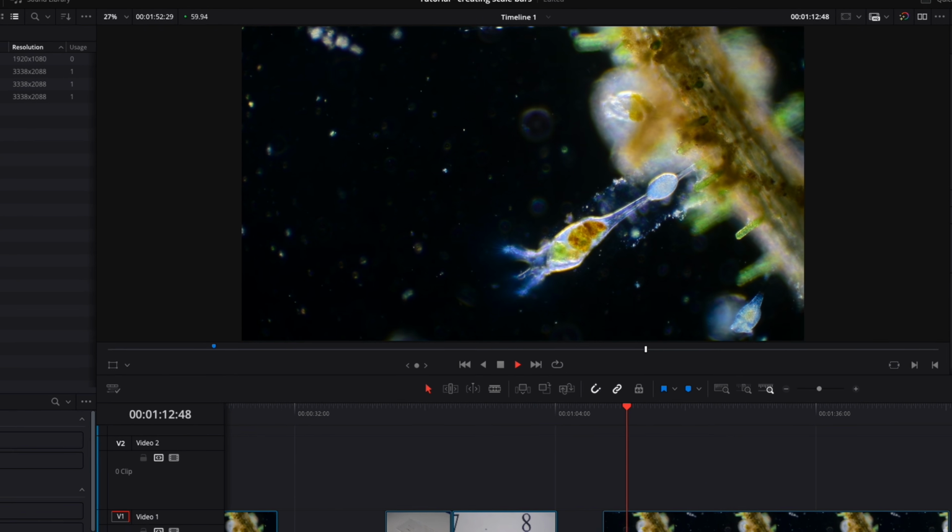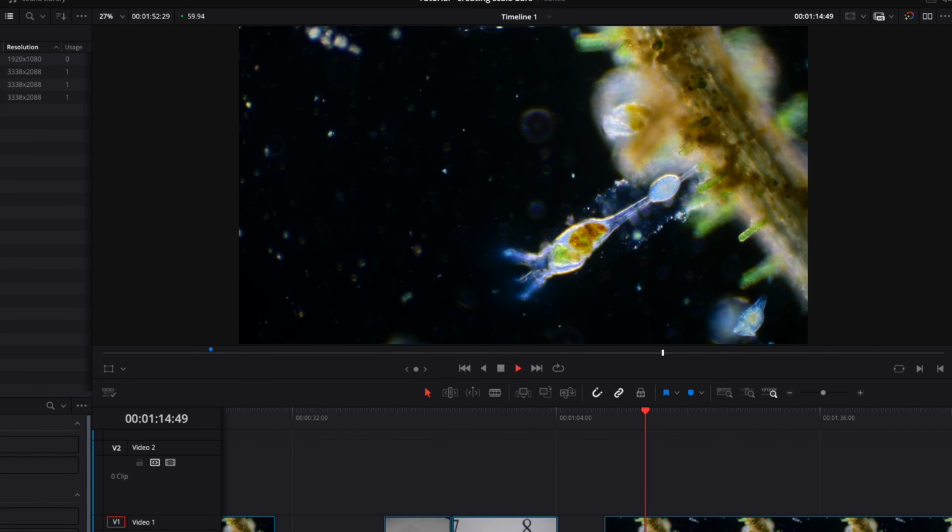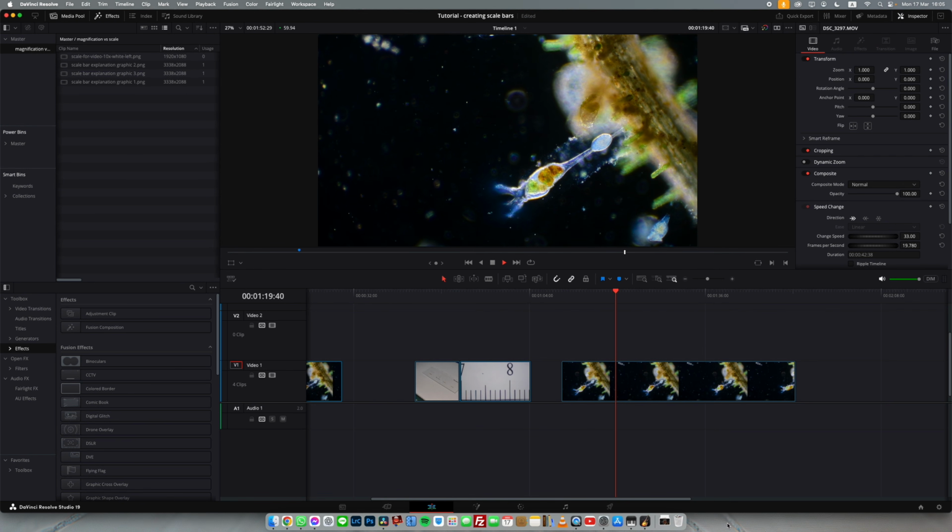This is the rotifer Colotheca. If you were to ask me how big is it, how should I respond? When we share videos and photos from our microscopes, it's important that we accurately describe how big these things are. Today, I'm going to share with you my method for creating scale bars that I add to my photos and videos.